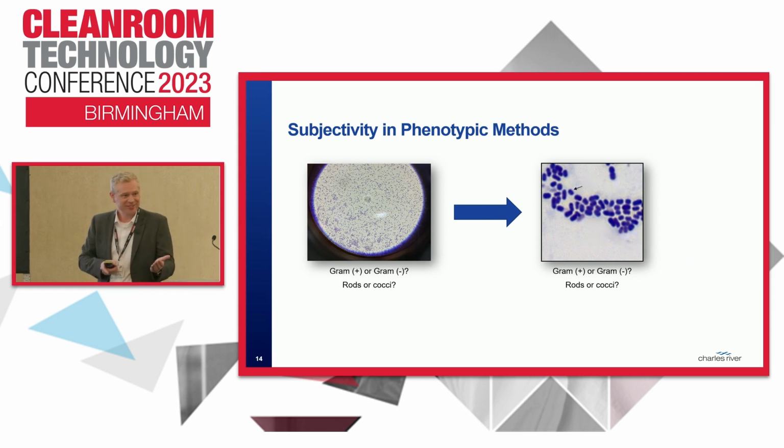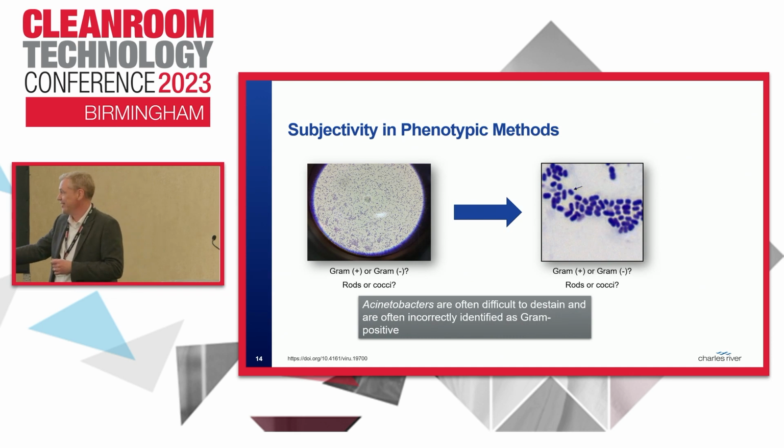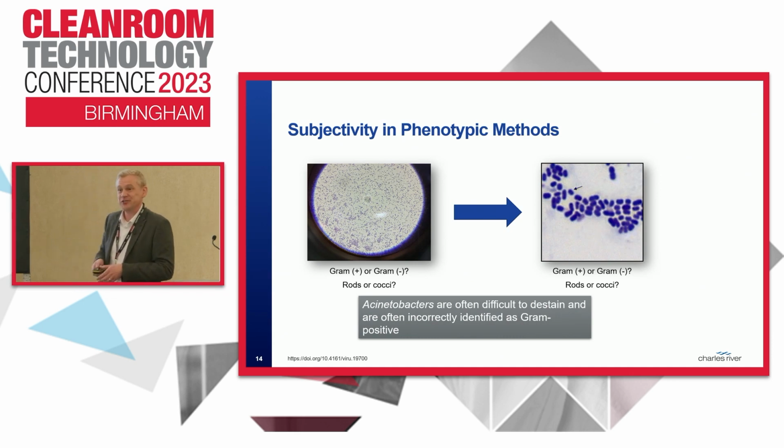Yes, you can. Some things are really obvious when you gram stain them. Really obvious what they are. But there's a lot of organisms that aren't. Okay, so if anyone's interested in reading more about it, the link to the article which discusses the issues with gram staining them is there. I believe everyone gets the slides after the conference.